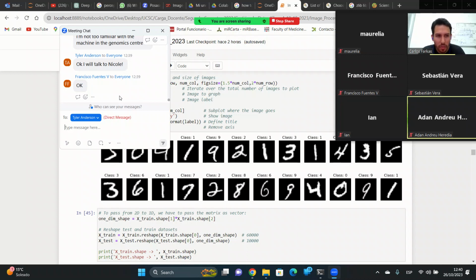So this is the end of the class. I hope you guys enjoyed. I know it's kind of a dry topic, deep learning, but it's very useful. So if you can search a little bit more about the parameters and what we did here, that is good. But this is just an example, you don't have to learn it, it's an overall example of what's going on with deep learning. So next class we'll get into more details. I will do a previous class on deep learning in order to understand the concepts, and then we'll go into the nuclear segmentation. But the problem is how to distinguish the true number of nuclei in an image. Okay?